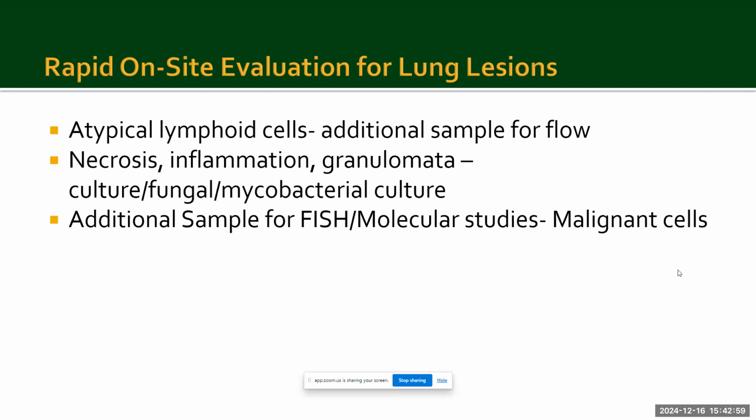If I am confident that we are seeing a malignancy in a lung lesion at rapid on-site evaluation, I tell them, hey, I need four more passes so that I have enough for patient molecular studies. And often clinicians abide by us, because they know we are going to ask for more. I think clear communication is the key to go, and asking for more is never going to hurt.